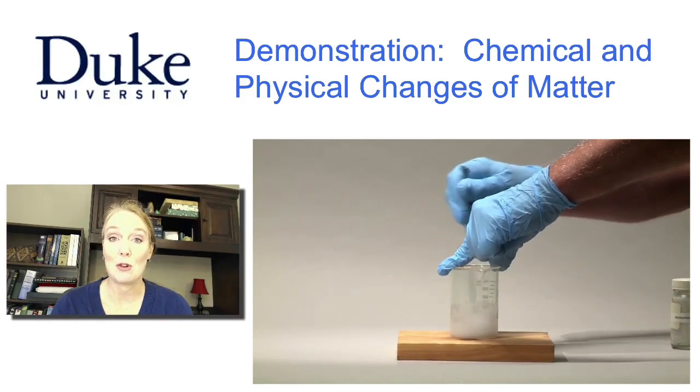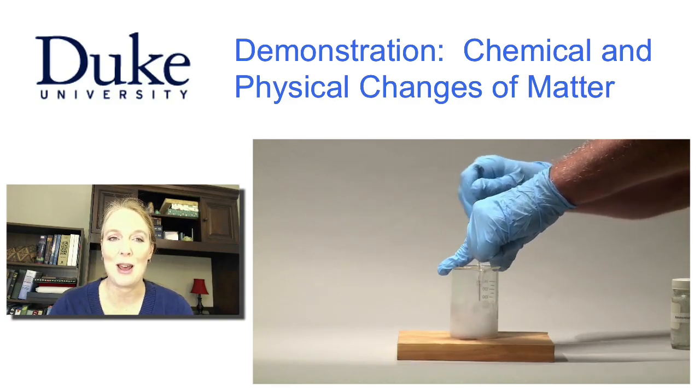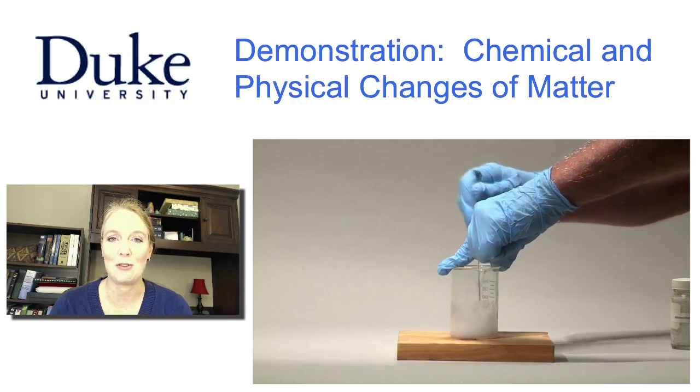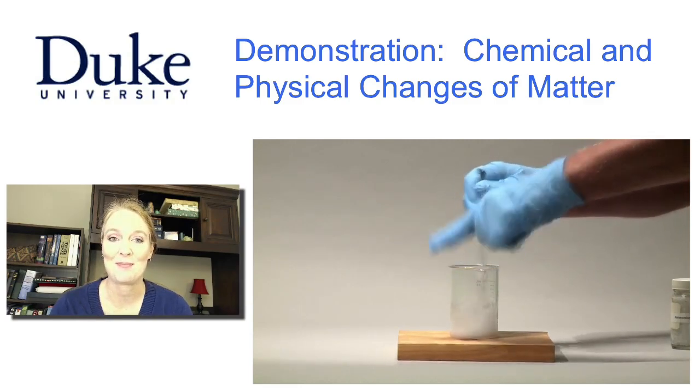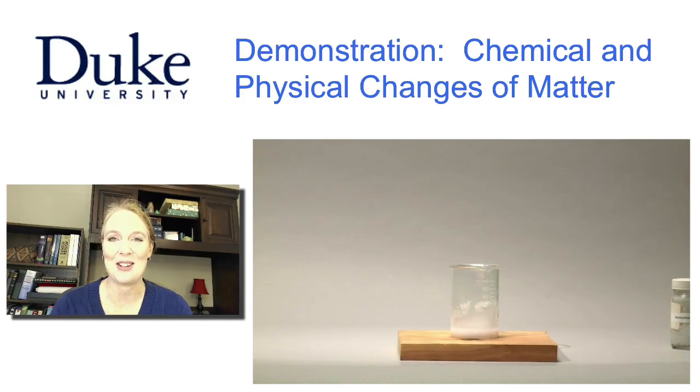If you were in the same room as this reaction and up close to it, you would probably observe the smell of another product of this reaction called ammonia. We could certainly smell the ammonia when we were filming this demonstration, which must mean that some of the ammonia is in the gas state so that it can reach our noses.